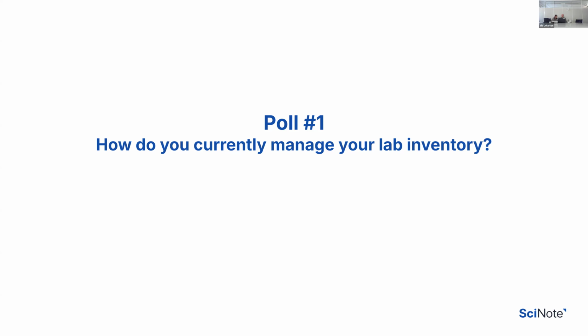I'll leave it open for a few more seconds just to see if any other answers come. Okay, answers are still coming in, so I'll leave it open. But it does look like spreadsheets in Excel are leading again. I'm gonna end the poll. Okay, Diana, I see Excel. Yeah, Excel spreadsheets. Let me end the poll and show the results with everyone.